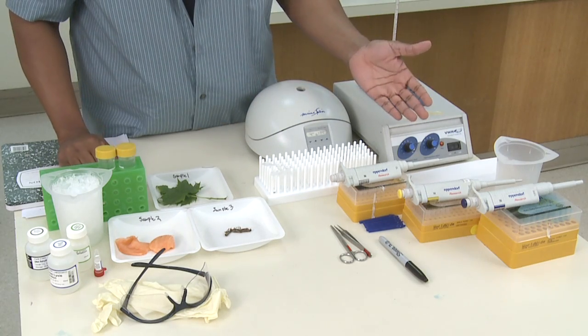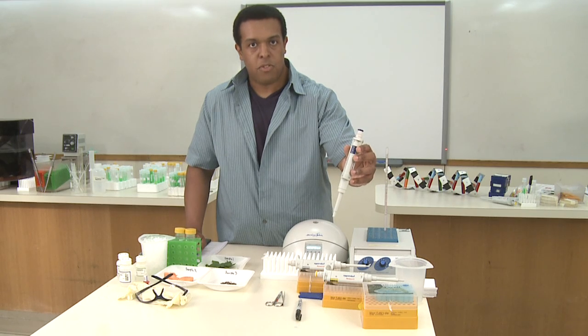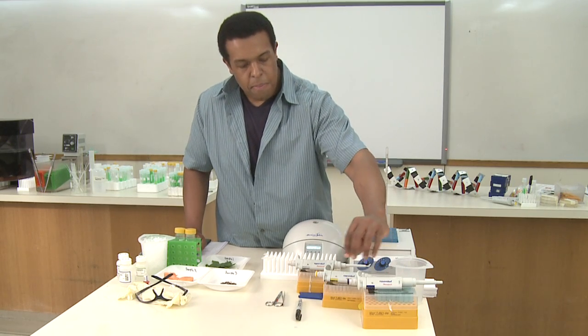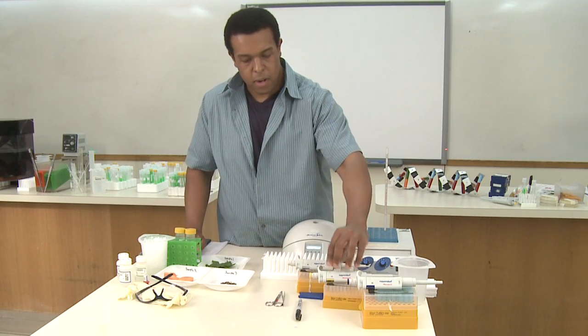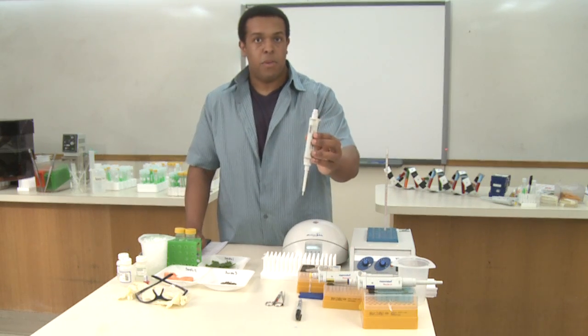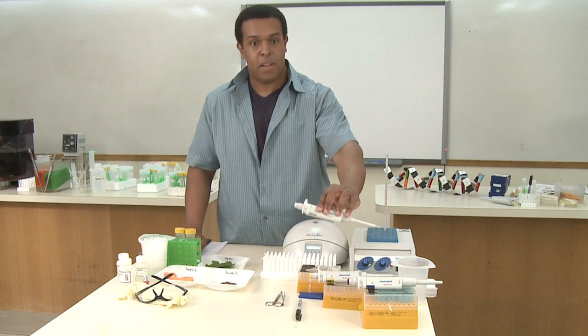We'll need micropipettes, and here I have the three sizes. The P1000, which holds from 100 to 1000 microliters, the P100, which holds from 10 to 100 microliters, and the smallest one, our gray pipette, the P10, which holds from 0.5 to 10 microliters. And of course, I have the appropriate tips for each size.